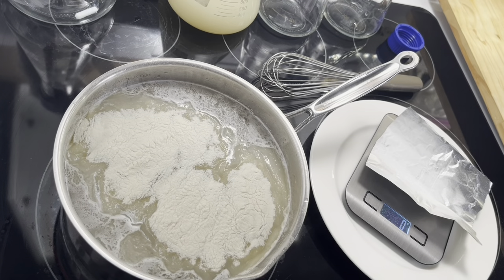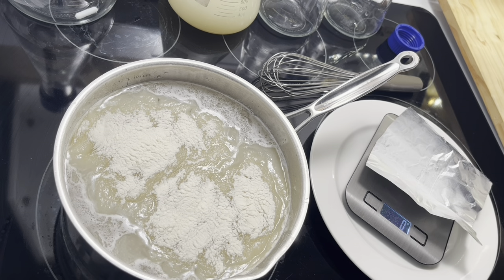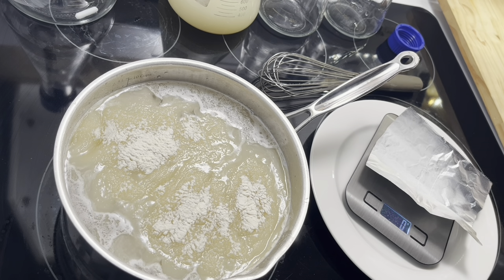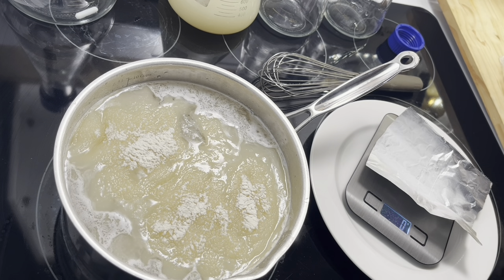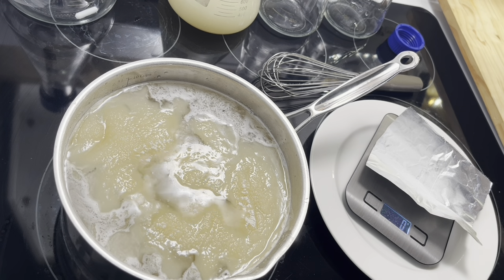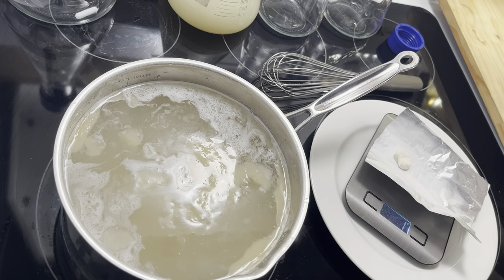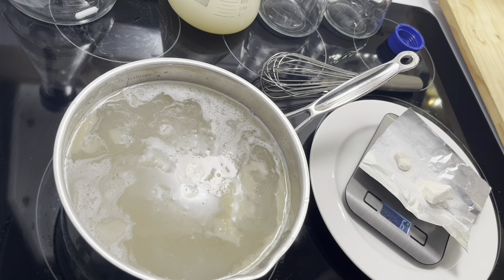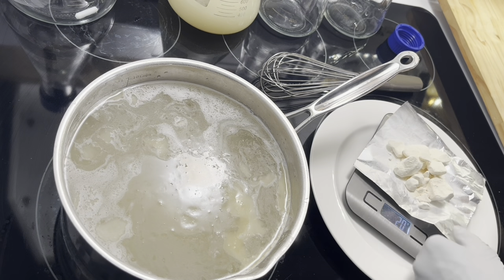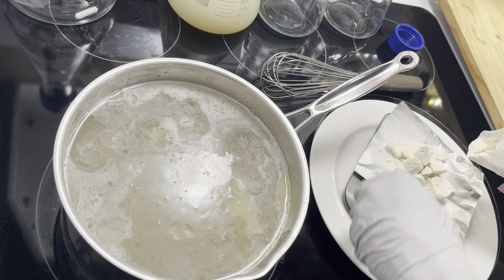Once the water starts bubbling, turn it down — you don't want to cook it hard, just turn it down. Now we're going to add our malt — the LME. I would use 14 grams per 1000 milliliters, but we're doing 2000 milliliters so I'm going to use 28 grams. Sometimes the scale needs a little motion to register new weight, so let's get it dialed in to 28 grams.